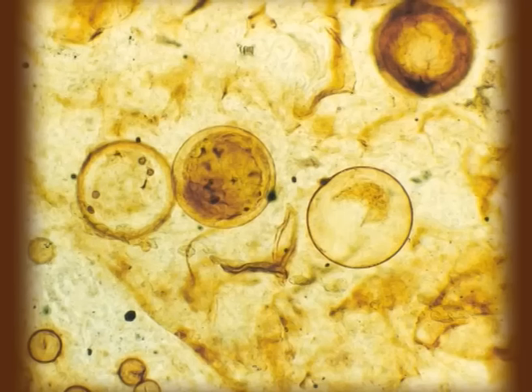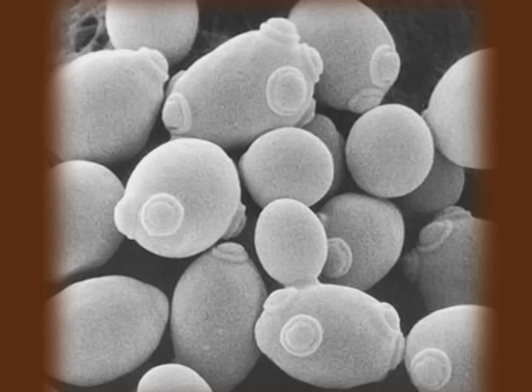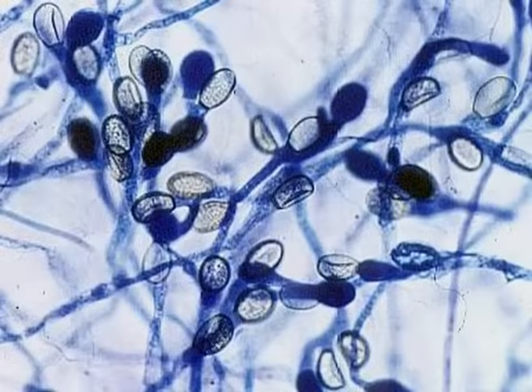Ma'am, if we have a mixed sample of microbes like fungi and bacteria, how can we differentiate them? They can be differentiated on a selective medium. Generally, we know that the fungus or yeast, they prefer a low pH. So if we supply the mixed bacterial culture and yeast culture on a selective medium containing low pH, then only the yeast will grow or the fungus will grow and the bacteria will fail to grow.